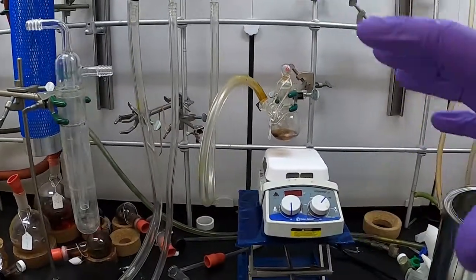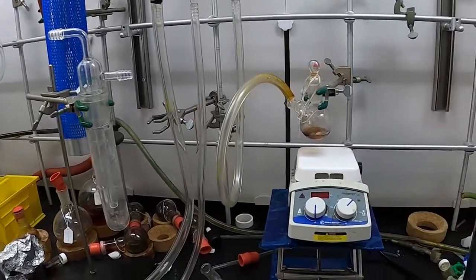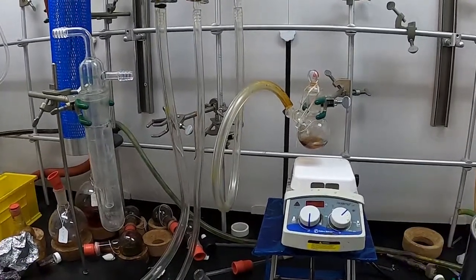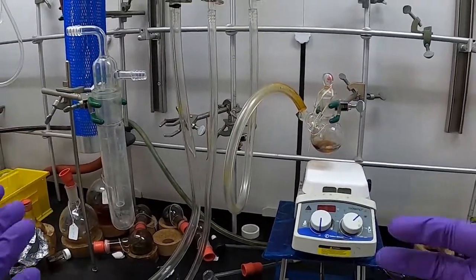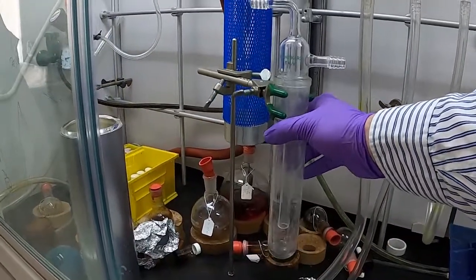Also, as you collect more in your main trap, your vacuum will begin to weaken. So we want to use an external trap so we can still do manipulations with our Schlenk line as we're doing other things.